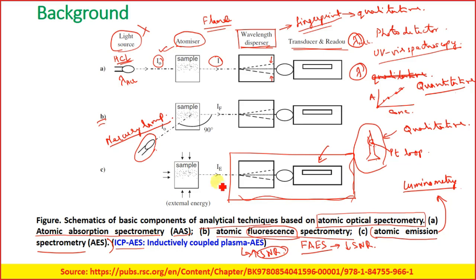It's just like video recording, you can record the stuff. When you do that, you will be able to develop this atomic emission spectrometry very easily in your lab. But you will have a low signal to noise ratio.